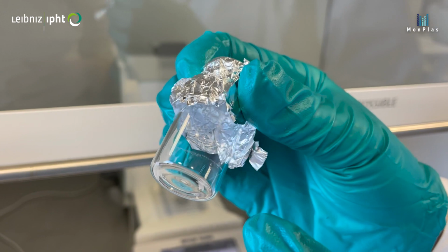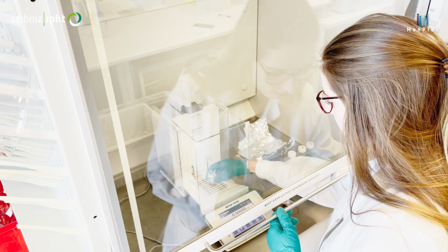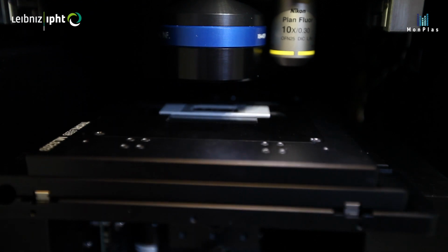But now on to microplastics. We developed a standard operating procedure with which we can prepare microplastic particles in our lab. These microplastic particles have a very irregular shape, so we can use them as reference materials for our analysis and for our measurements here. We validate the quality of our reference materials using spectroscopic methods.